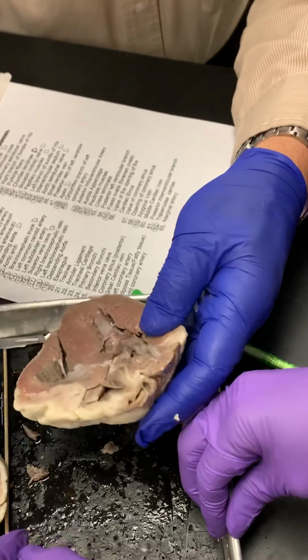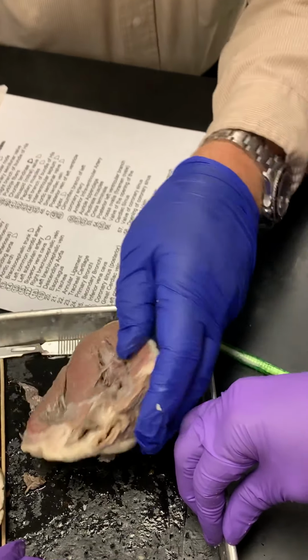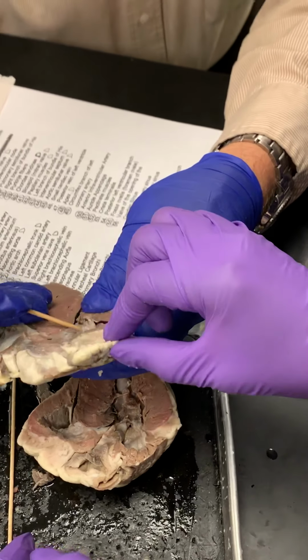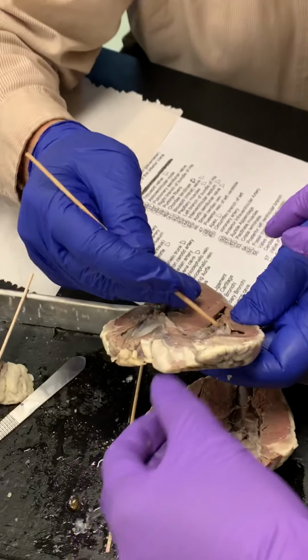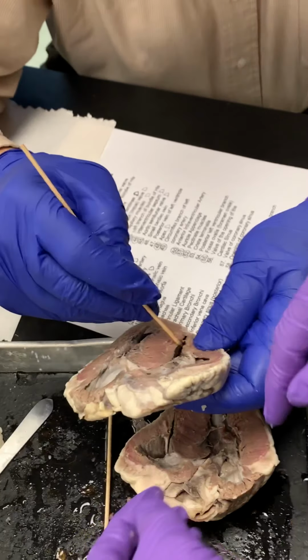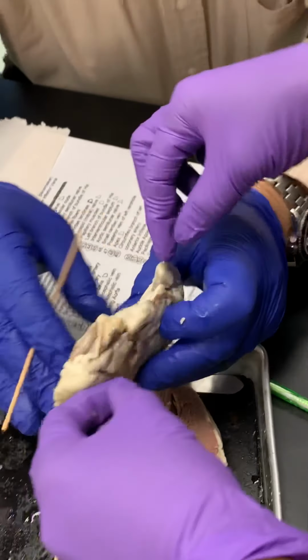So septum, left, right. So what valve is this then? This is the tricuspid. Tricuspid, right? It's the right side. It's the tricuspid. Yeah. And then this looks like the superior vena cava.